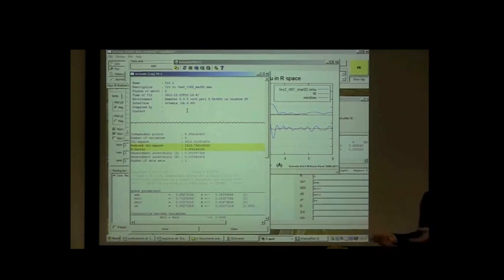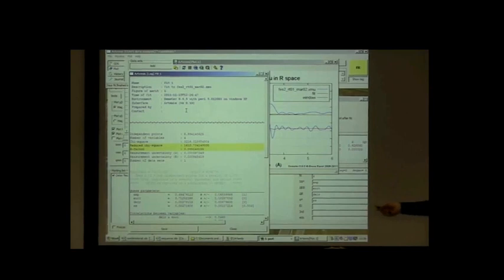Delta R is a small number with a larger error bar. So basically our delta R is consistent with 0, which says that the iron-sulfur distance that was used in the crystallography data is consistent with our data. That's a perfectly reasonable result.